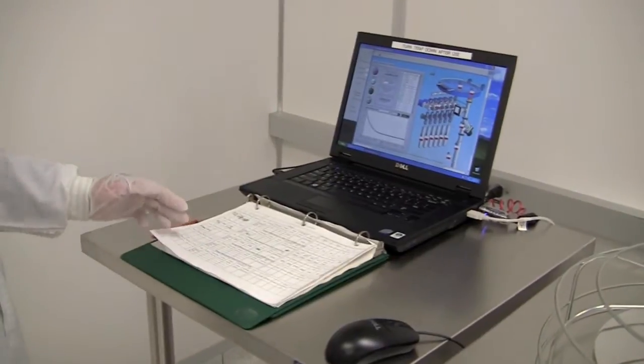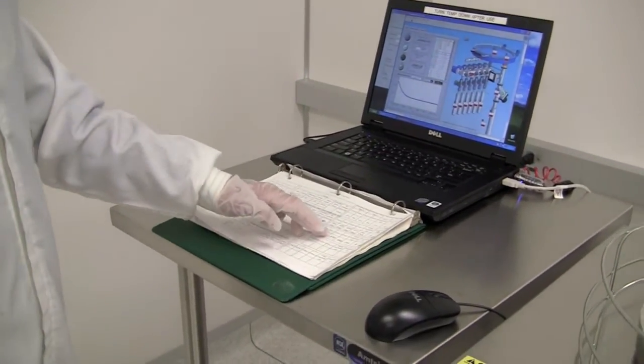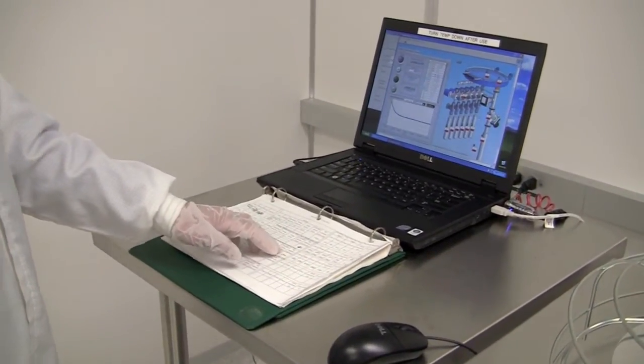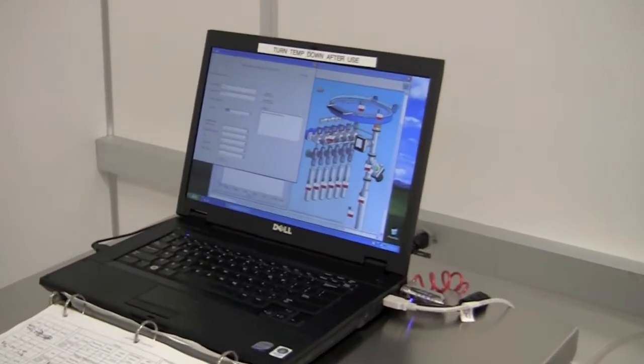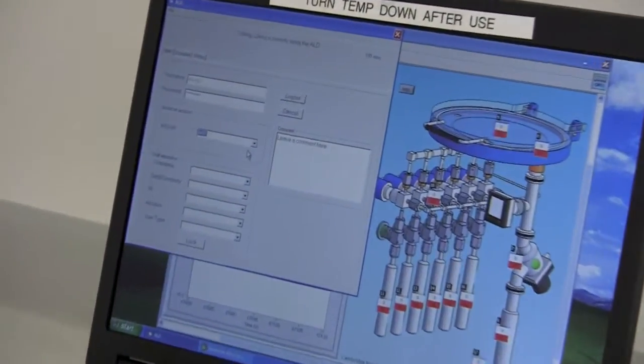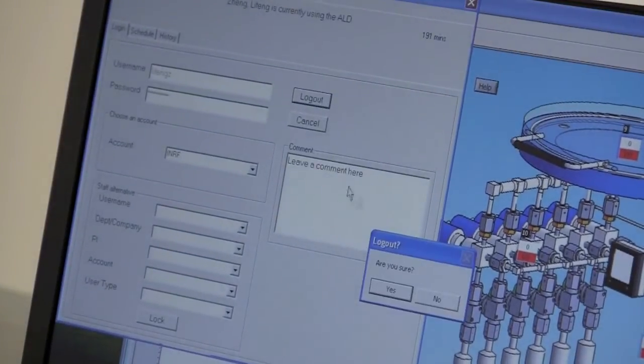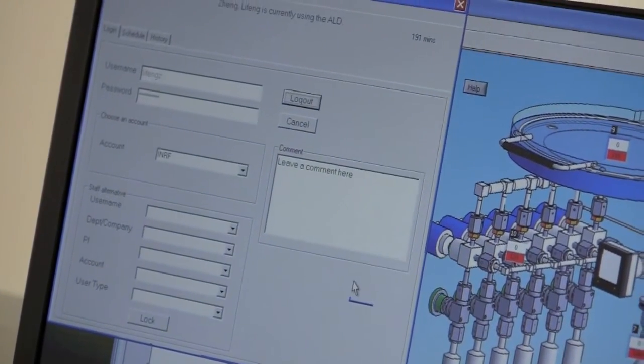Before you log out, make sure you write down all the information on the log sheets. Then select the account. Log out. And you're done.